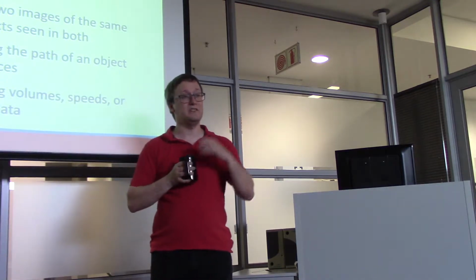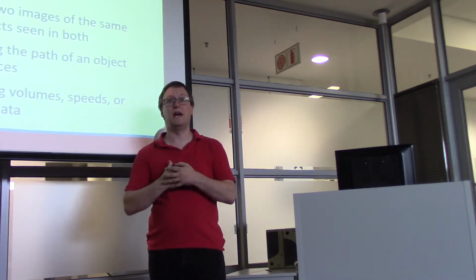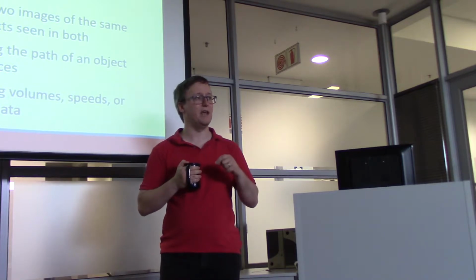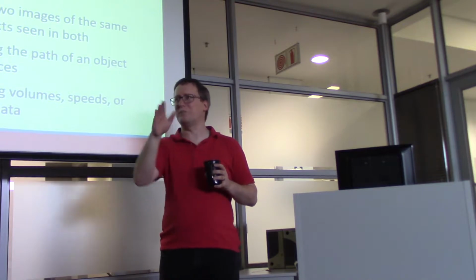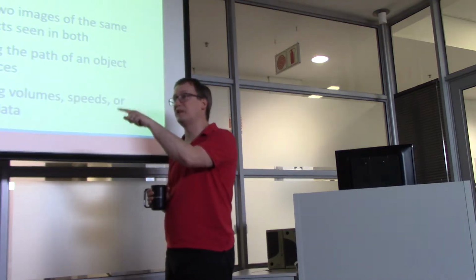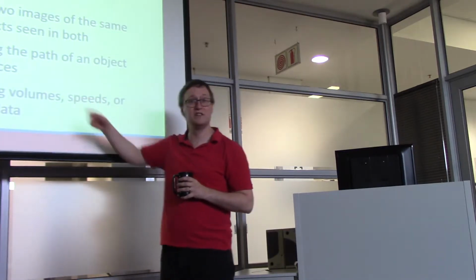So this is the ability to register that a hand in one frame maps to the hand in the next frame. In biology, we need to do this all the time. Imagine if you were to take microscopy data from cells in culture, and you're taking a new snapshot every minute over the space of a day. Your ability to recognize that this cellular boundary has moved, maybe you're looking at amoeba, I don't know, and this pseudopod has grown slightly in this direction, requires that your brain be able to say, or that the computer be able to say, this pseudopod is the same as that pseudopod, and this point maps to that point between these two images. That is an exercise in registration. And that relates very strongly to motion analysis.